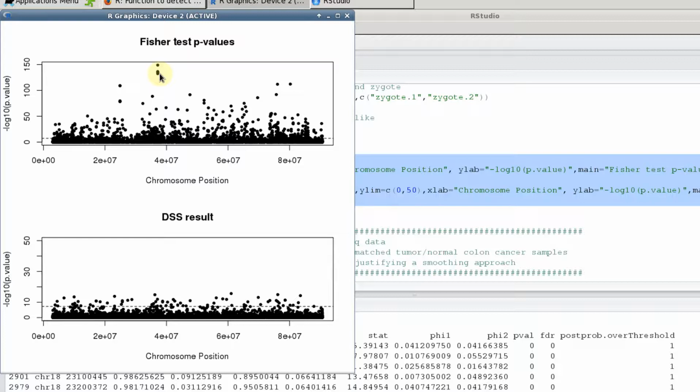The reads are not independent of each other. For oocytes, we have 2 different oocyte samples contributing reads, and so the reads within each oocyte would be correlated with the other reads within that oocyte. So you have 2 distinct clusters going in, and they're not independent. The Fisher test was not really the appropriate way to analyze these data. BSmooth or DSS were more appropriate. They account for all of the variation, including both the biological and the technical variation. And so when you run DSS, you do get this more conservative set of results. We saw this with BSmooth as well. We had more trouble detecting differentially methylated regions because of the sparseness of the data.